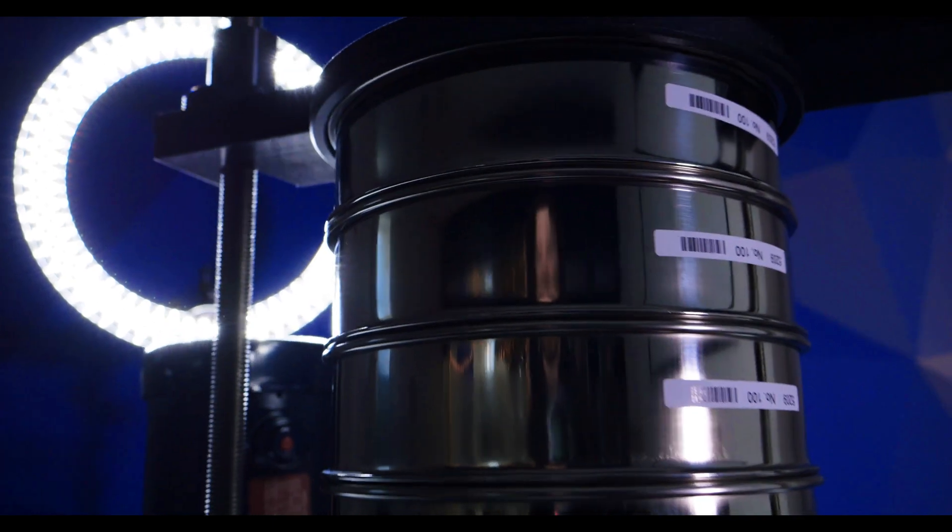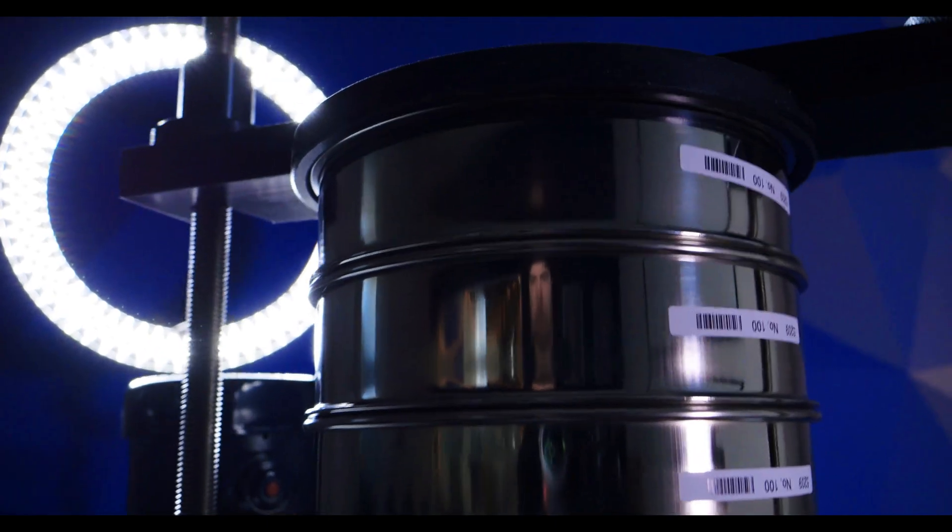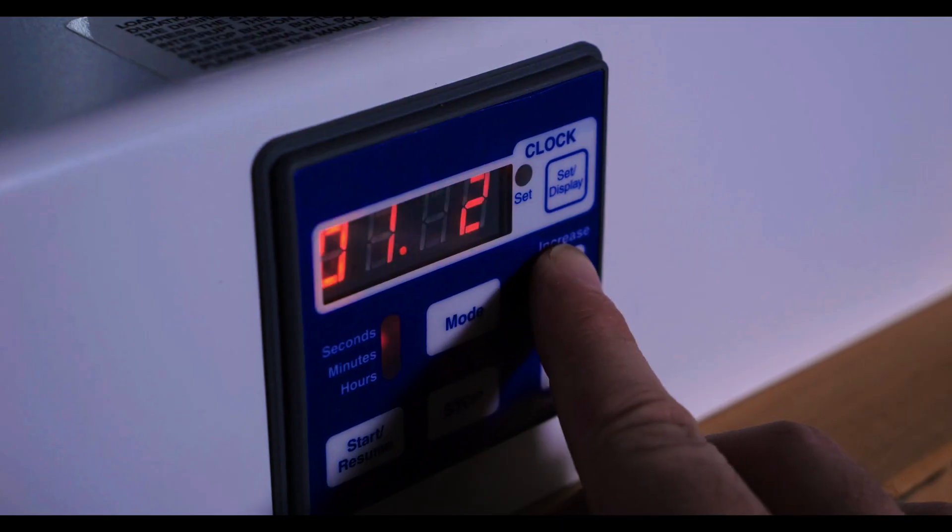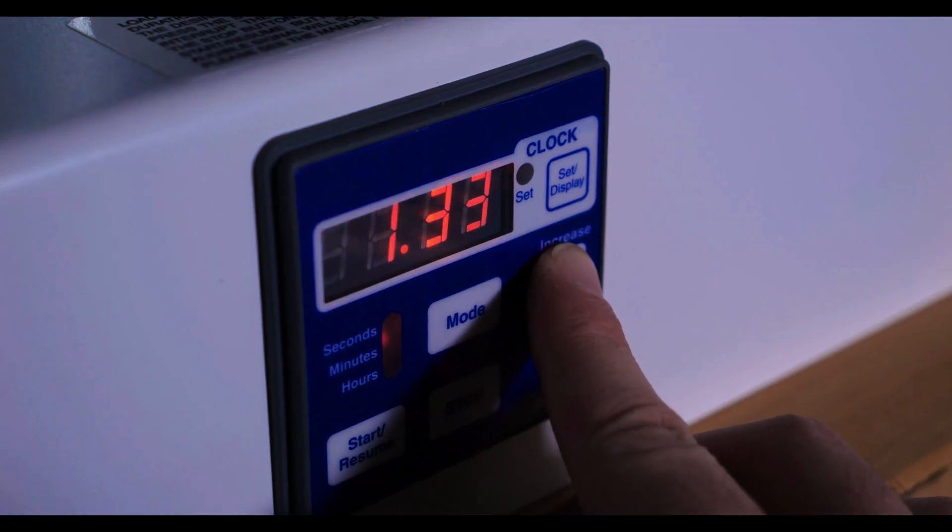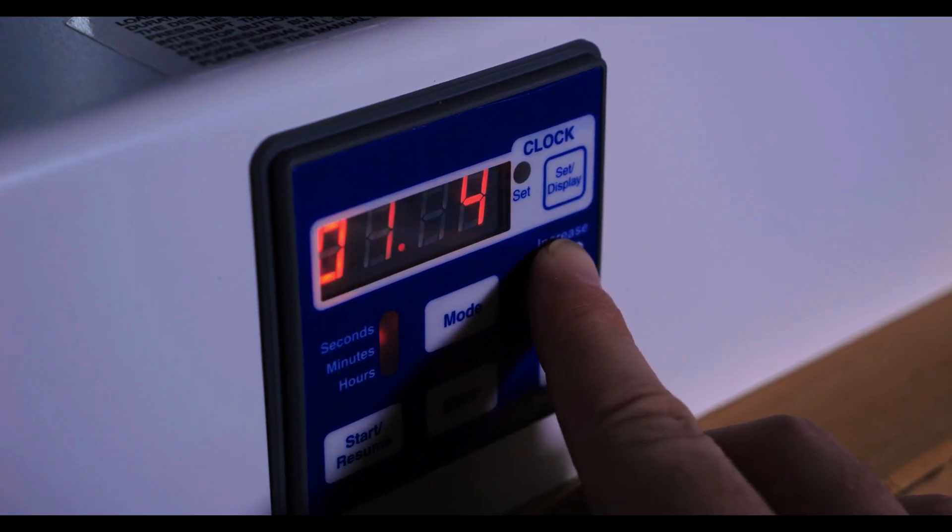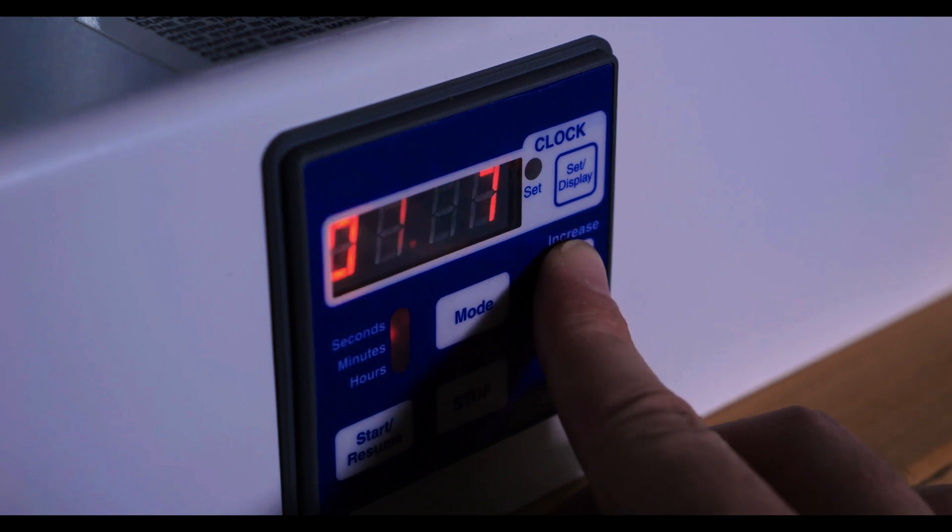Also, the operation duration can be set using a digital timer similar to the RX-29. With the RX-812, particles can be tested for up to 99 minutes.